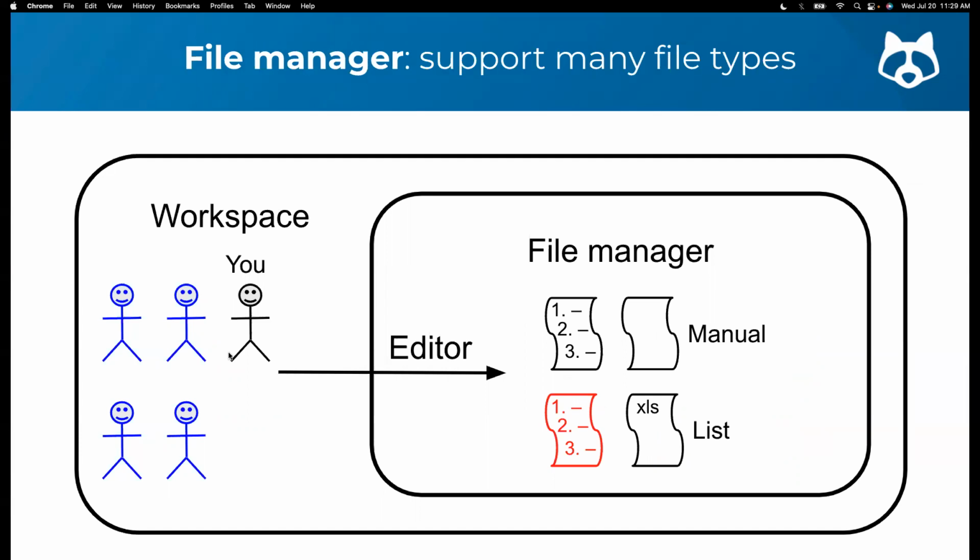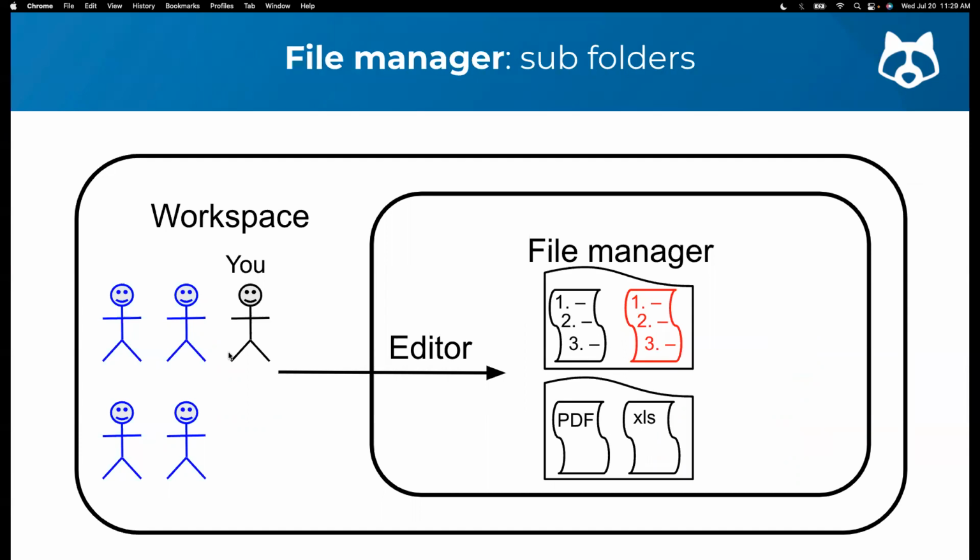As mentioned before, the file manager supports many types of documents, not only protocols. You can upload PDFs, Word documents, and Excel spreadsheets. And all files can be further organized into subfolders.